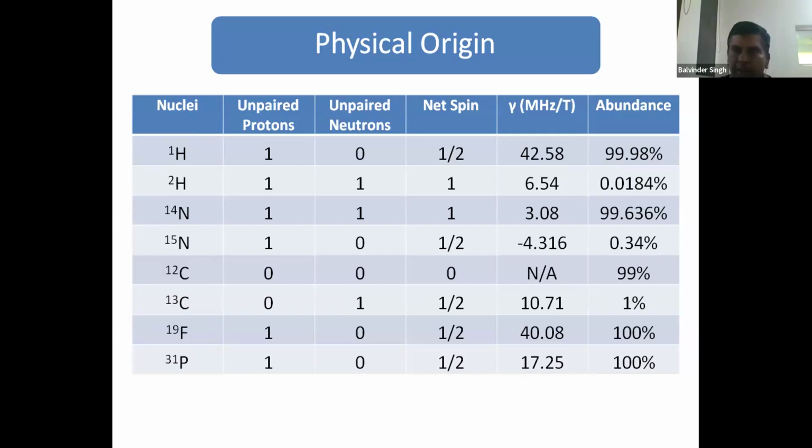The NMR instrument which is at present at MIT University Gurgaon is a low field, not a high field NMR, but we can use it for recording proton, carbon 13 and fluorine also. And we can use them for signal identification, for the normal acquisition of the signal.